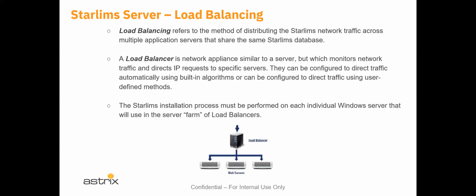So a load balancer is a network appliance. It's similar to a server, but it monitors traffic and directs IP requests to specific servers. They can be configured to direct traffic automatically using built-in algorithms, or can be configured to direct traffic using user-defined methods. There's an entire science to managing and installing and running load balancers.